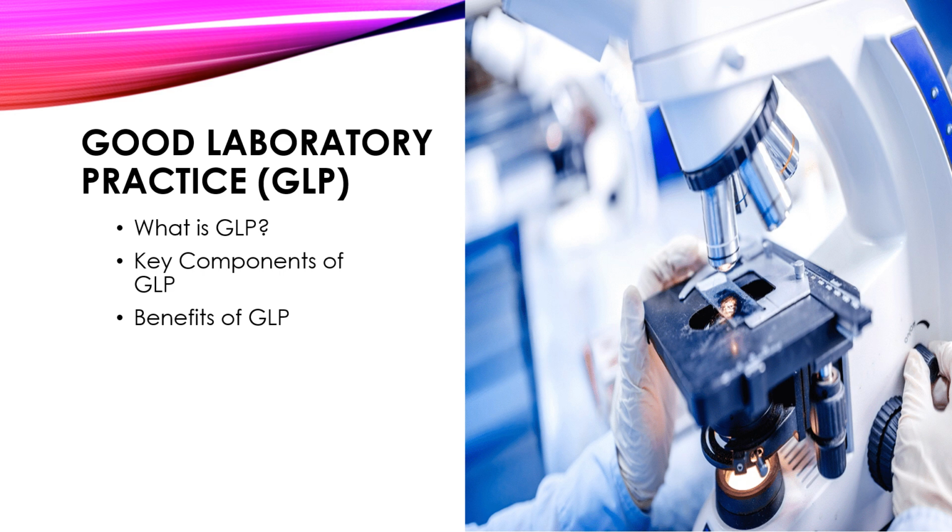Quality assurance, QA. Now, this is the last but not the least component of good laboratory practice. QA measures are integral to good laboratory practice implementation and involve ongoing monitoring and evaluation of study processes to identify and address deviations, errors, or deficiencies. Quality assurance activities may include internal audits, inspections, proficiency testing, and corrective actions to maintain compliance with good laboratory standards.